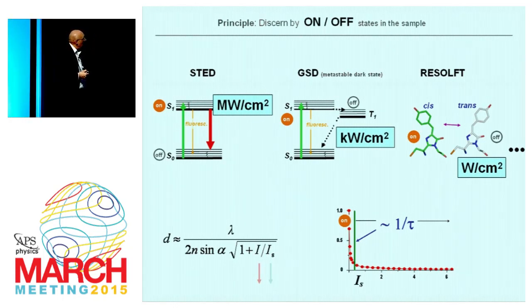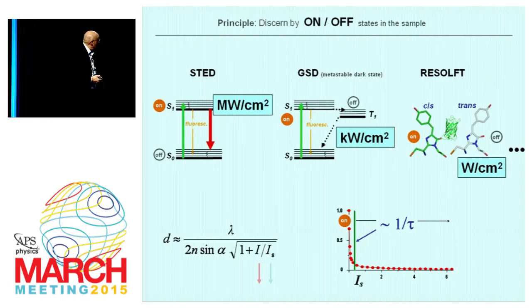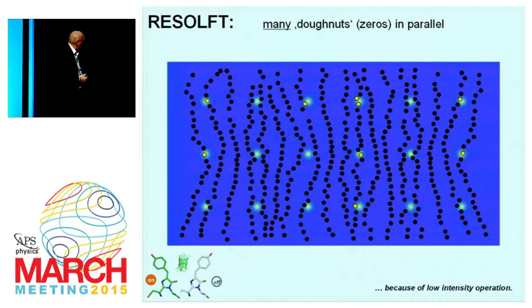And let's assume now we take this transition, which is of course very favorable because you can also find them in switchable fluorescent proteins. When I realized this, I was very, very excited. Actually, the first switch of GFP was done by my co-laureate, W. Moerner. And we used special fluorescent proteins in this particular example that I'm showing you here in order to demonstrate the usefulness of switching fluorescent proteins.